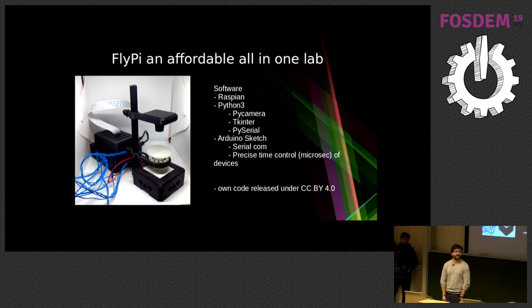OK, one last question. How long is the image delay? Can you work with your hands and not have too much delay? Right. So the question is, what is the image delay between the camera feed and what we see on the screen? And this is really wonderful, because the Pi camera library sends everything via GPU directly. So there is very little, if any, delay. I could not observe any delay. So really, this is why you can focus.